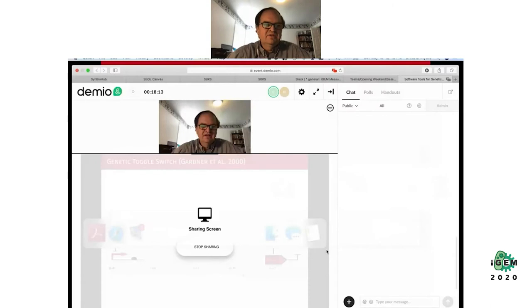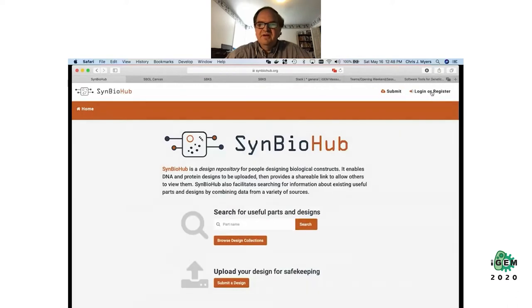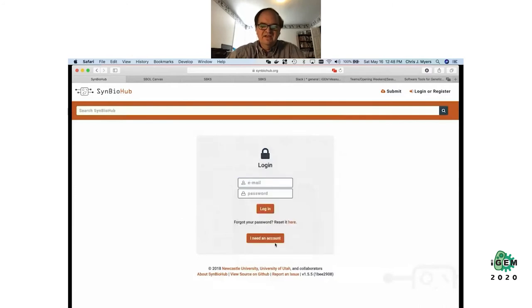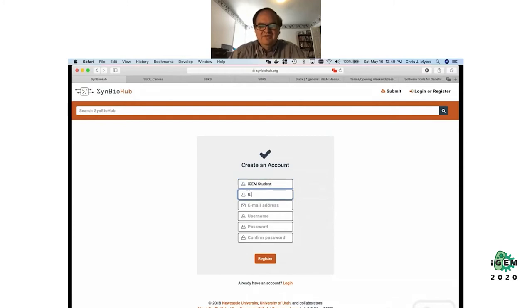Let's go over to the SynBioHub data repository. The first thing you're going to want to do is get an account. I'm going to sign up — I'll put in a name, university, email address, username, and password. So now I've registered for an account.